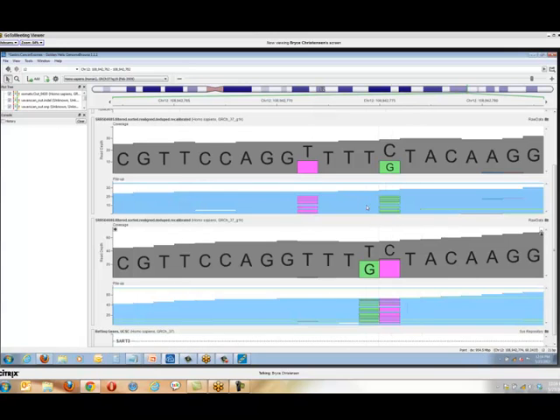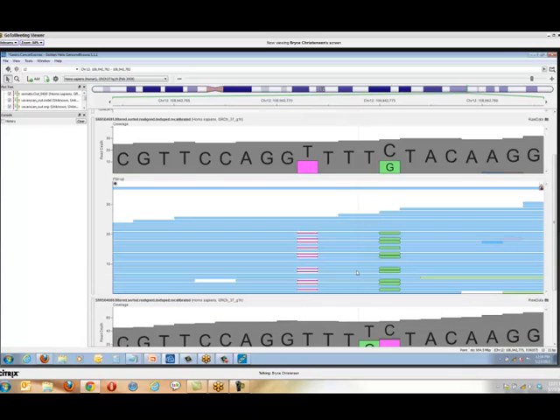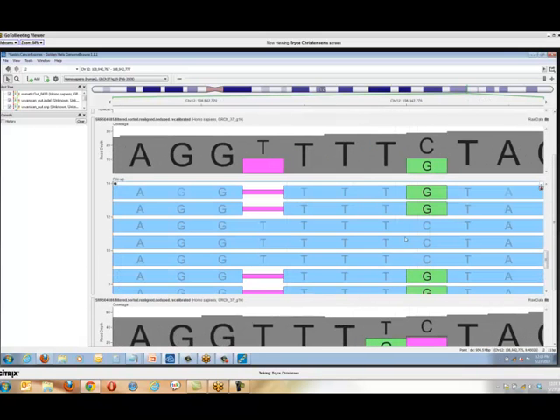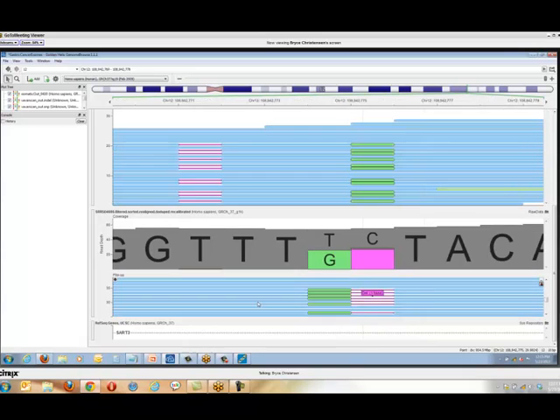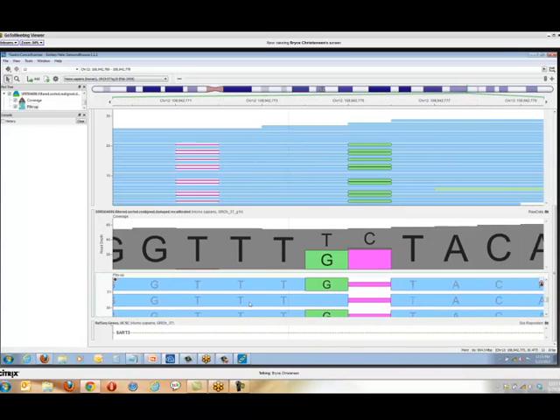Oh, you can see now how the alignments finally came up. So if we zoom in, we can tell that they're on the same haplotype. They're always on the same set of reads. Basically, up here, it's G, TTT, GT on that haplotype. If we come down and look at the other sample, the tumor sample, and zoom in around it, we see that it's exactly the same. G, TTT, G, and then it skips over to the T. So two different ways to align the same little spot. It lights up and says, oh wow, there's this awesome somatic mutation, but when you dig into it, it's nothing of the sort.